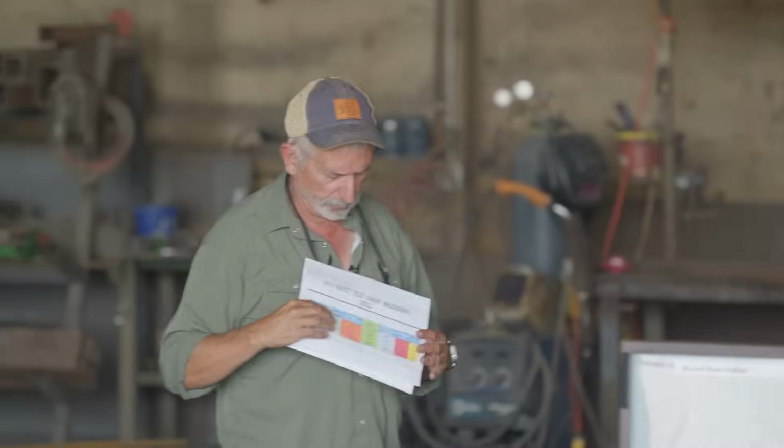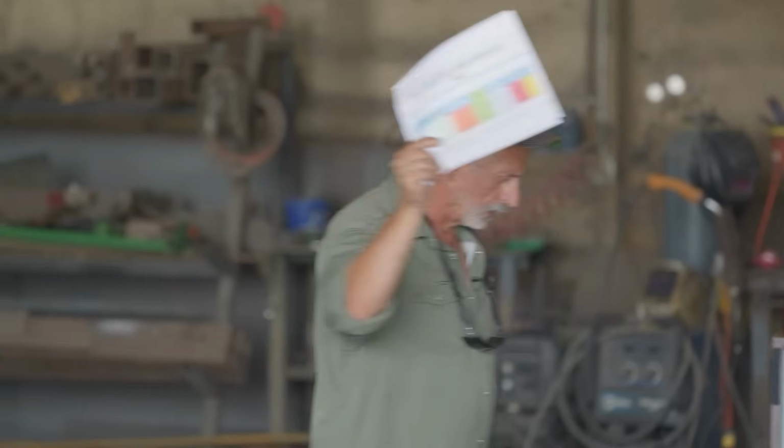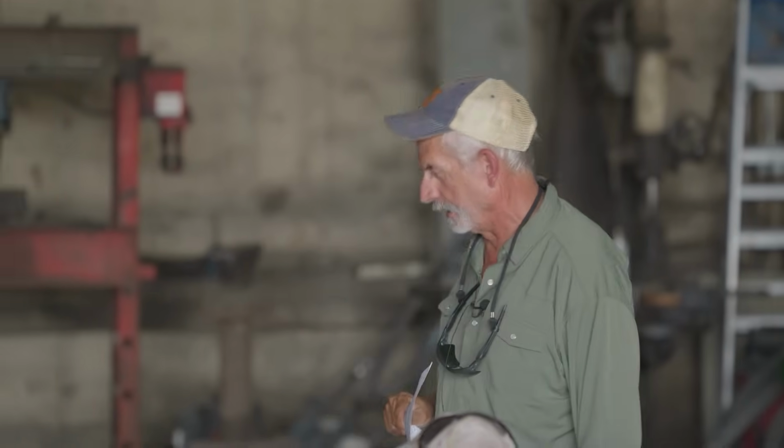Okay. I'm going to show you how to read this. It's called the Haney test. Dr. Richard Haney, ARS USDA, our sister agency, soil microbiologist. I met him in 2011.